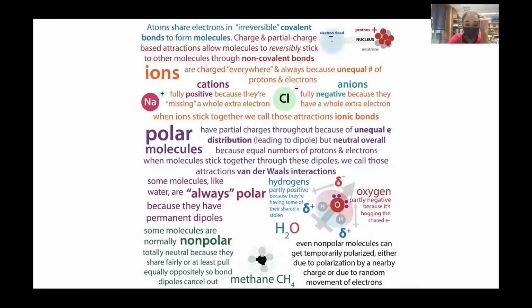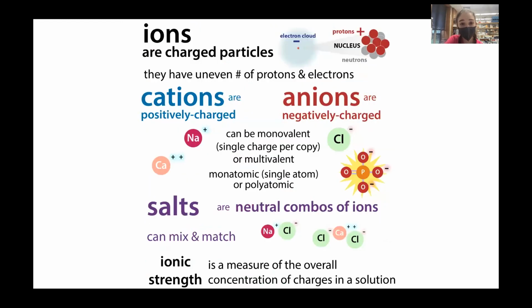So you have all this water hanging out around both the RNA, because remember the RNA has that backbone, and then it's going to be hanging out around the salts. And our goal is to get the salts to hang out with the RNA, because right now the water is hiding them both, because we have that high dielectric constant. So the water's kind of hanging out with everything. So we want to reduce the amount of water and replace it with something that is less polar.